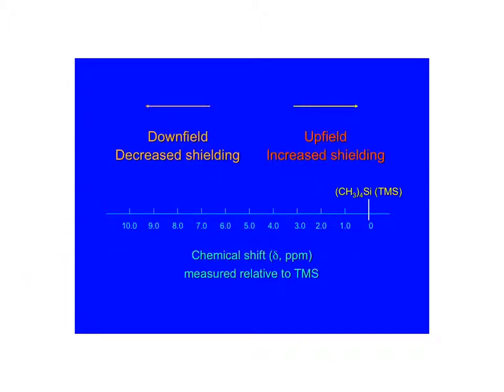Okay, this is where I get my football analogy. So, for whatever reason, both carbon and hydrogen NMR is not read left to right, it's read right to left. Historically, I have no earthly idea why, but because of that, the zero is on the right-hand side for carbon and for hydrogen NMR, and all the positive numbers go to the left. So I apologize now, but that's just the way it is.